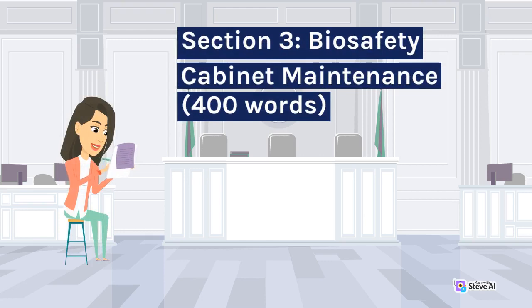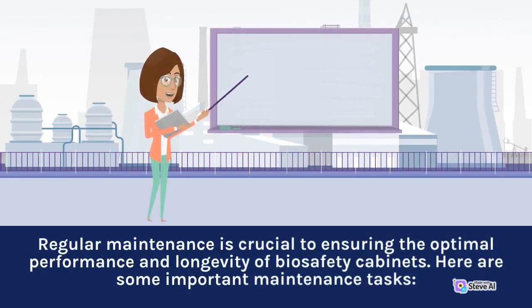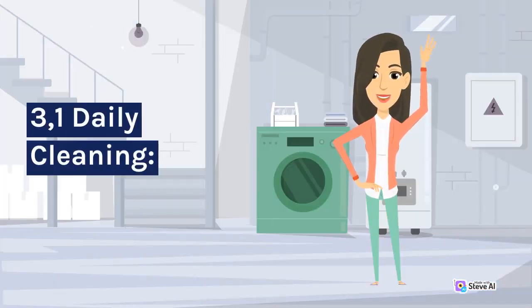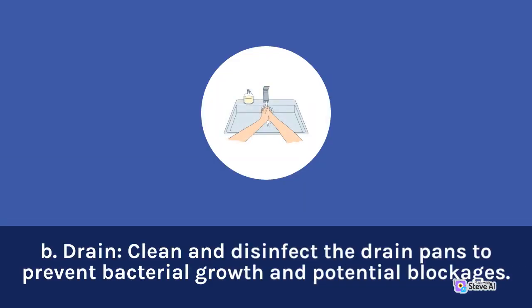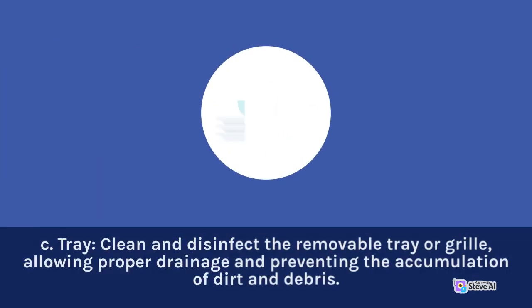Section 3: Biosafety Cabinet Maintenance. Regular maintenance is crucial to ensuring the optimal performance and longevity of biosafety cabinets. Daily Cleaning: A. Surfaces: Wipe down the interior surfaces with an appropriate disinfectant, using lint-free disposable wipes, to maintain cleanliness and prevent cross-contamination. B. Drain: Clean and disinfect the drain pans to prevent bacterial growth and potential blockages. C. Tray: Clean and disinfect the removable tray or grill, allowing proper drainage and preventing the accumulation of dirt and debris.